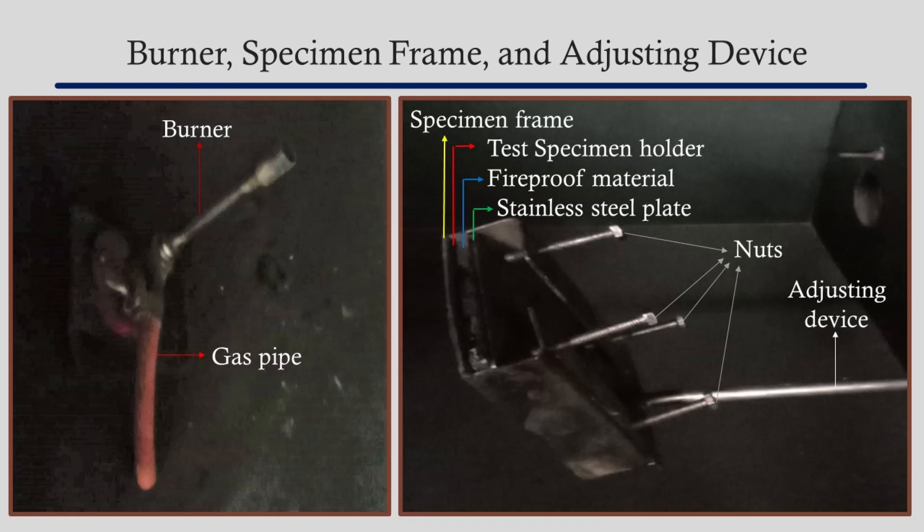The fireproof plate is supported by a stainless steel plate. The trio comprising of the sample, fireproof plate, and the stainless steel plate constitute the main components along with the specimen frame. An adjusting device is also connected with the specimen frame. It can be operated from outside to move the frame once the smoke chamber is closed, and is used to adjust the distance between the burner and the flame.